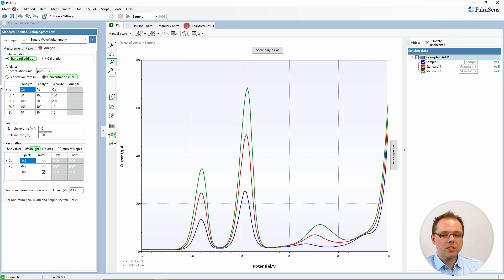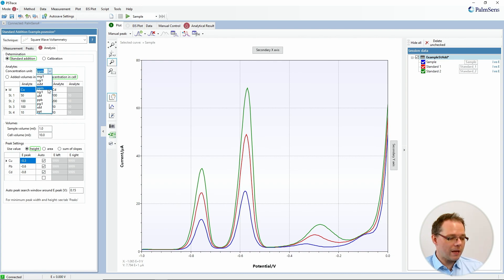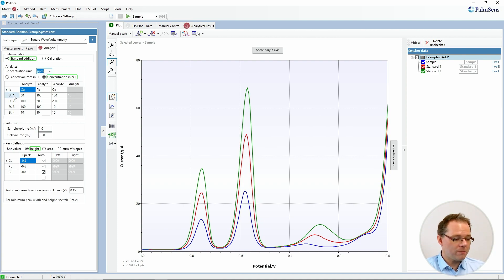The next choices you have are determining what type of solutions you're going to use in your measurements. You can set the settings so that you just have fixed concentrations in the cell, and you would choose the concentration unit here. You can choose different units, for example ppm, but also milligram per liter or millimolar. With concentrations in cell, you would then just enter the different concentrations for all the different measurements you do — so for your standard one measurement you would enter, say, 50 ppm concentration of copper, which I have added here.